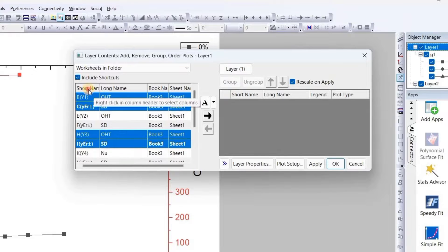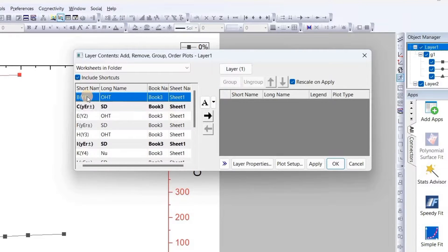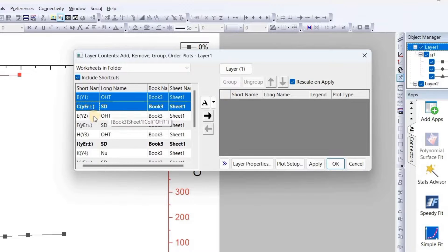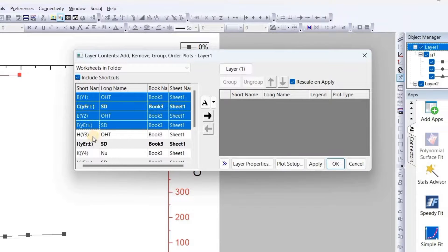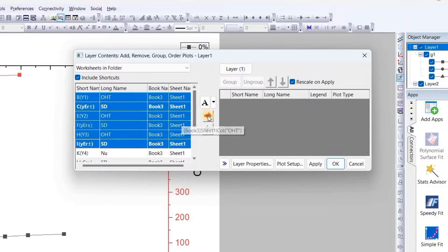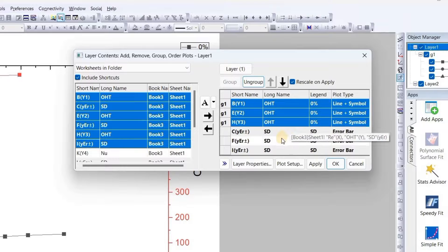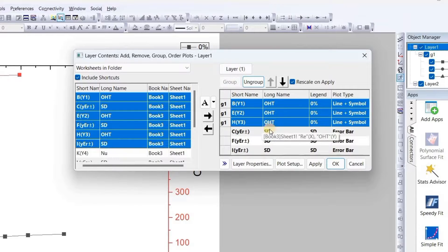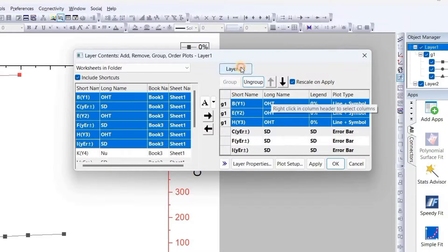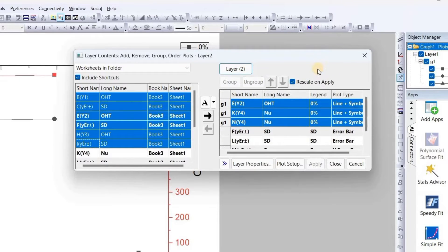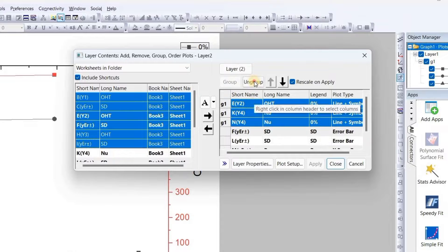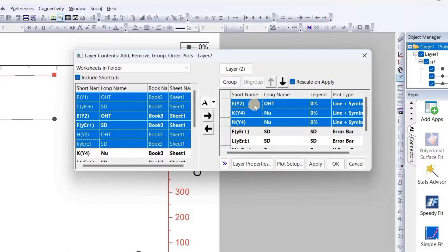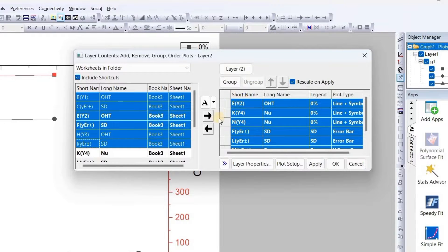Now we will add manually to our graph. First make it name-wise, then we will select them: B, C, as per their standard deviation E, F, H, I. These three are OHT, we will add this one to this side. We did this.